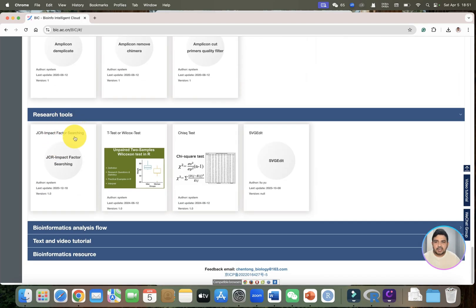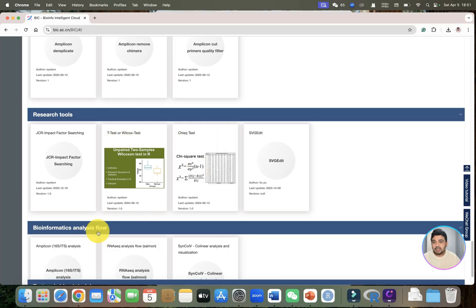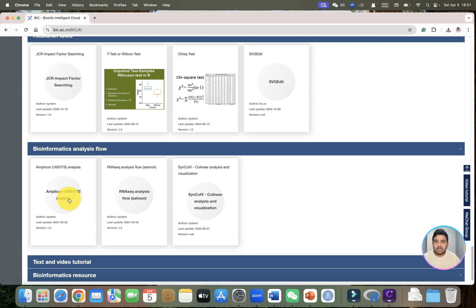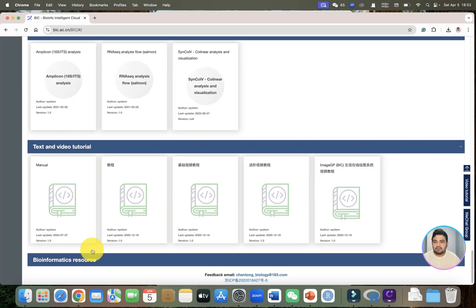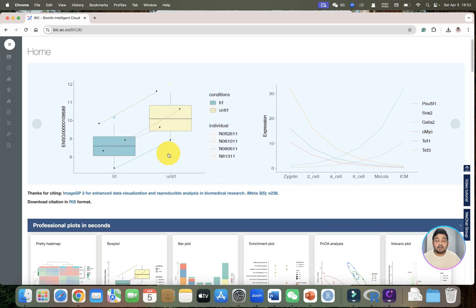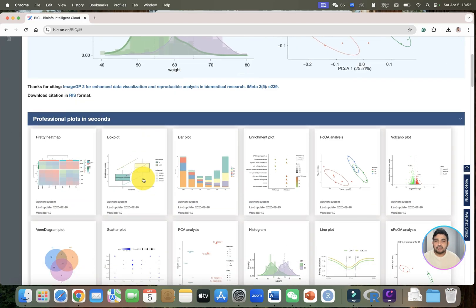We have research tools as well — we can run t-test, Wilcoxon test, and chi-square tests. Similarly, we can also do amplicon analysis and RNAseq analysis. Even more interesting, for each graph and plot they have presented examples with demos and text and video tutorials.